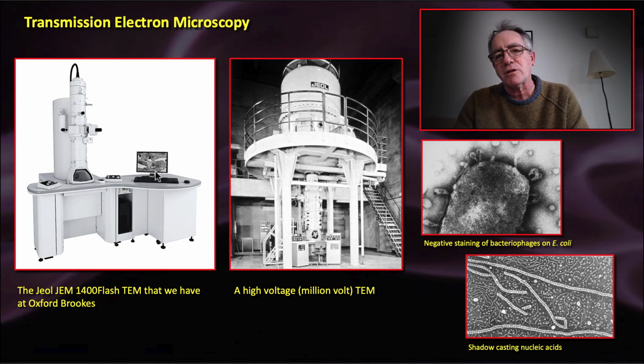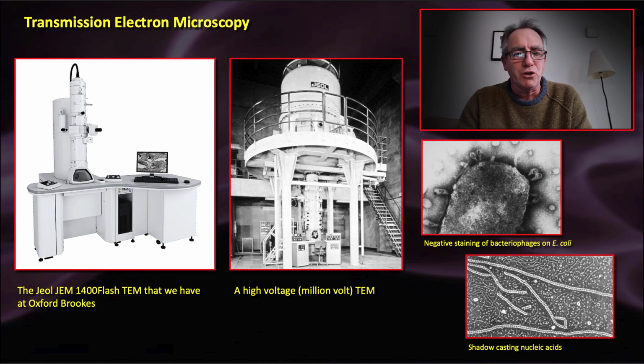And of course, there's quite a lot to learn about running the microscope when you're imaging. You can of course adjust zoom and things like that. You can adjust the fineness with which you image the specimen, but there are lots of other things. Somebody that's an expert using electron microscopes will learn to adjust those condenser apertures and things like that so that the electron beam is perfectly centered and they get the best resolution possible.